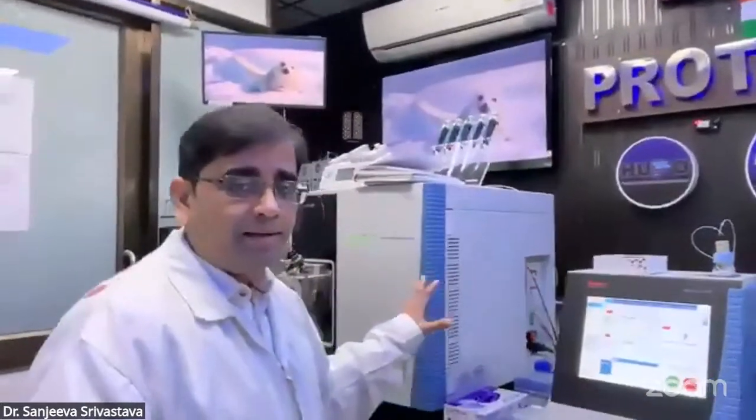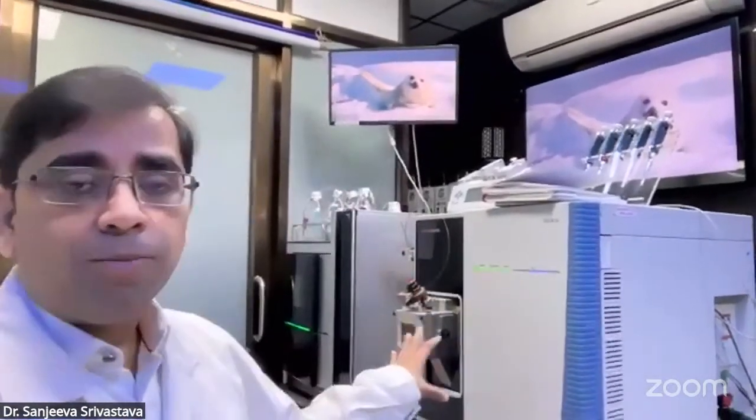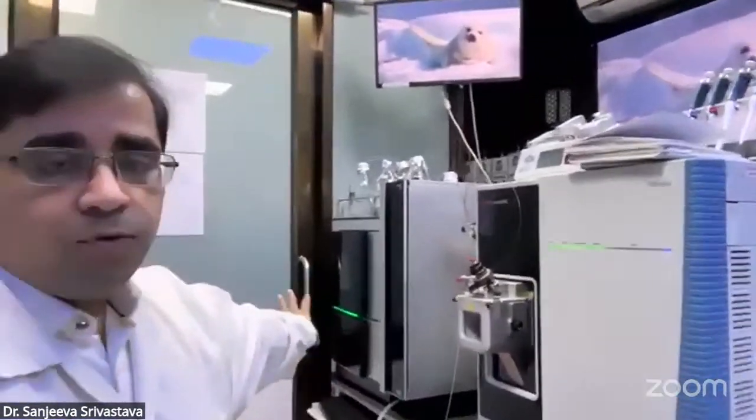On this side is another technology, the triple quadrupole mass spec. Once you have done the discovery work, now you want to validate your target, whether it's proteins or metabolites or lipids. You now know the specific molecule of interest, so you don't have to screen again for hours and hours. Now we can do targeted proteomics or targeted metabolomics, again with chromatography at a high flow rate.